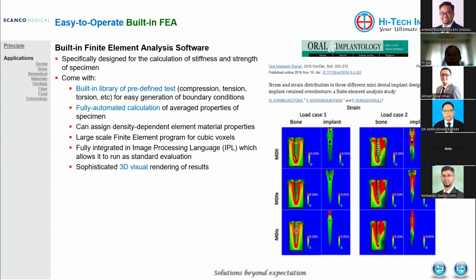So basically you do not need to really have a sample like a bone with an implant put into it. What you need is you just need to provide the information. You need to scan the implant separately and the bone separately. So you submit into the software, which we call finite element software, and then it will do the simulation calculation. So you do not need to do the experiment. It's just a simulation test.